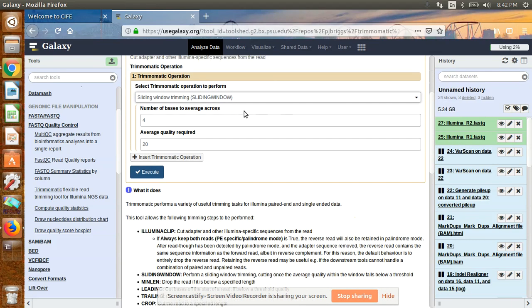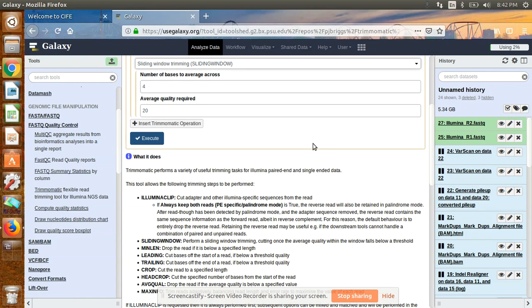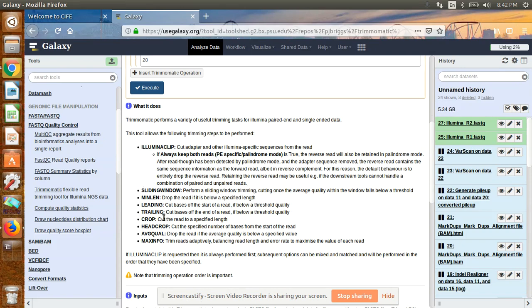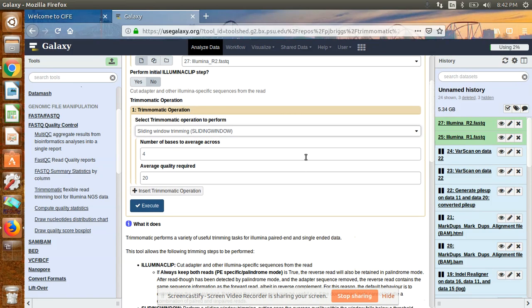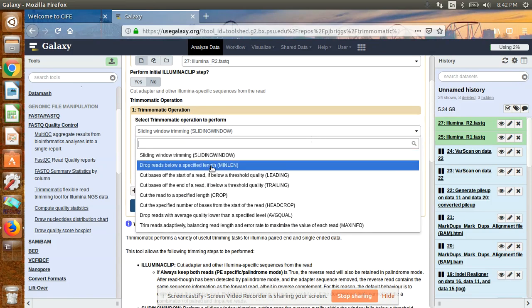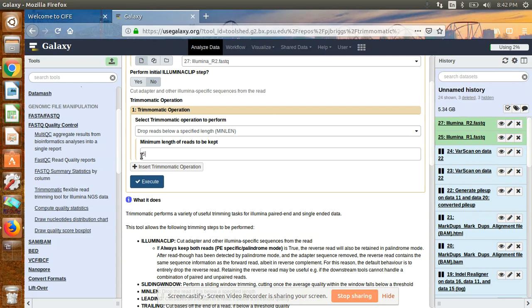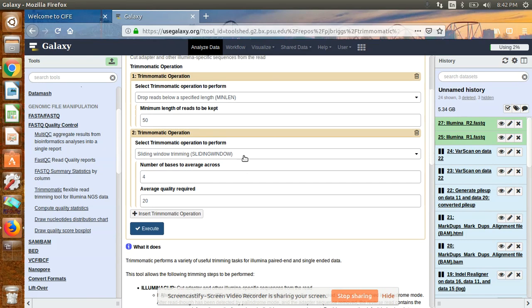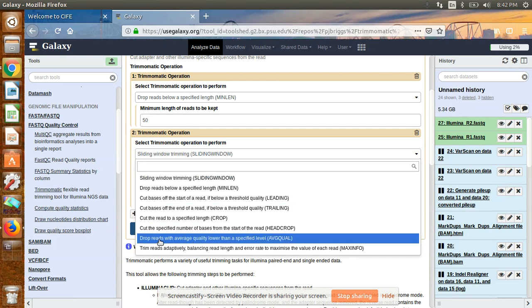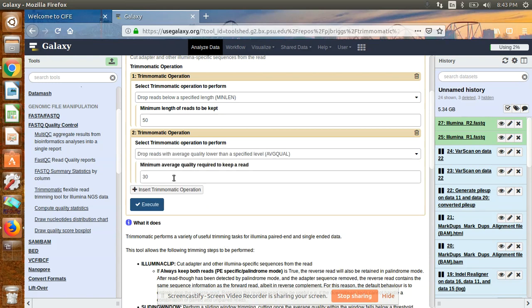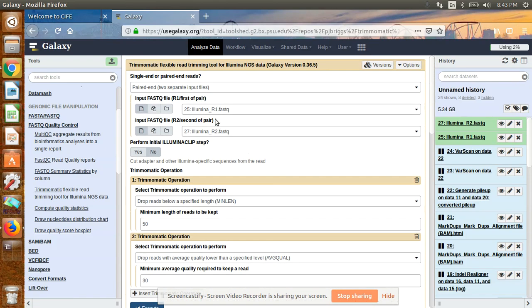You can read about the different parameters available for trimming. Generally I choose two: first, drop reads below a specific length; second, drop reads whose average quality is below a particular value — I select 30. A Phred score of 30 means there is a probability of error of one in one thousand. So we have selected paired-end sequencing, given R1 as forward and R2 as reverse, and set these two trimming operations.